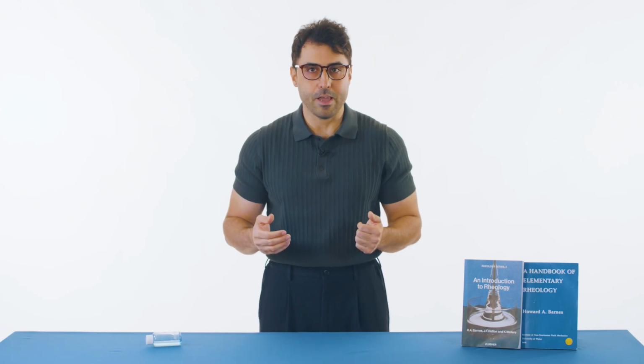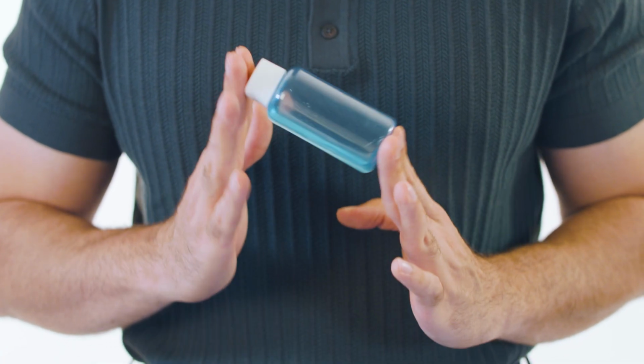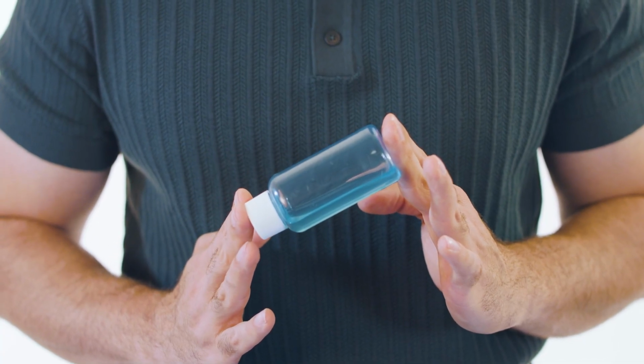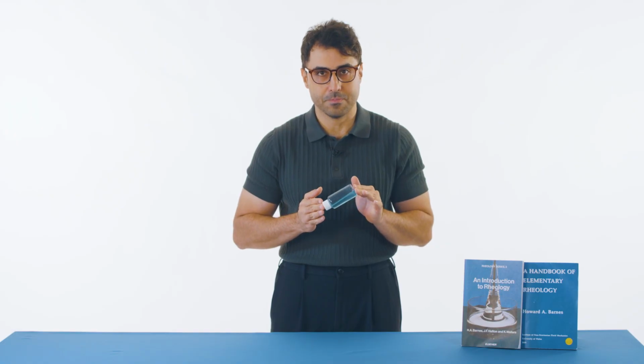Here's a simple way to visualize it. When I oscillate this shampoo bottle quickly, it is like high-frequency deformation. You only see some elastic wiggle. There is no visible flow. But when I slow down the oscillation, the shampoo starts to flow. That's exactly what a frequency sweep test reveals.